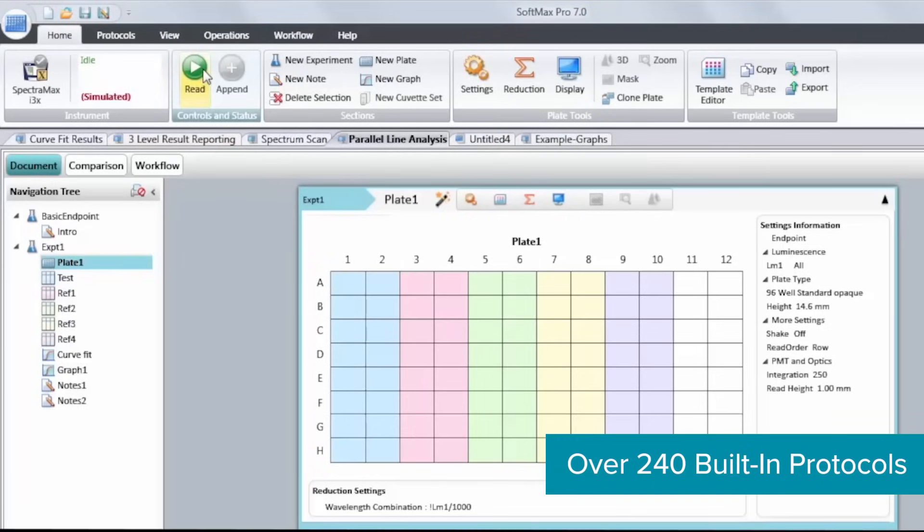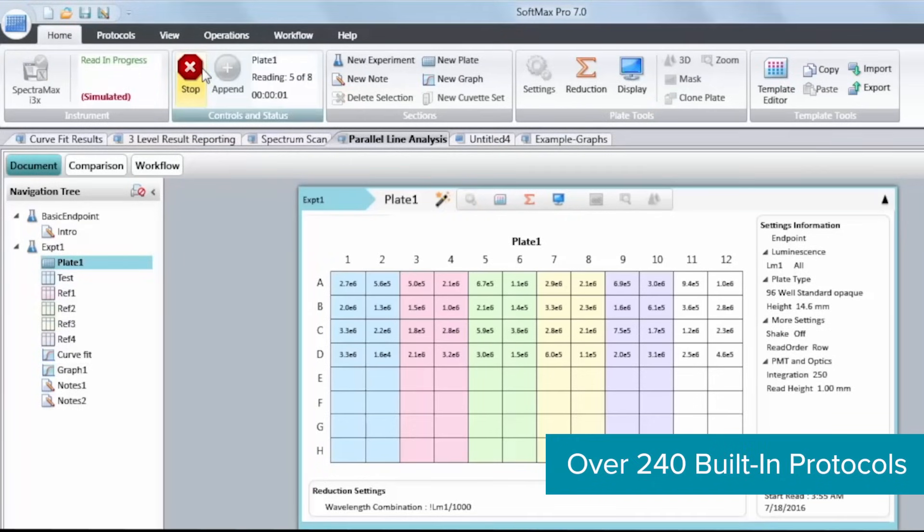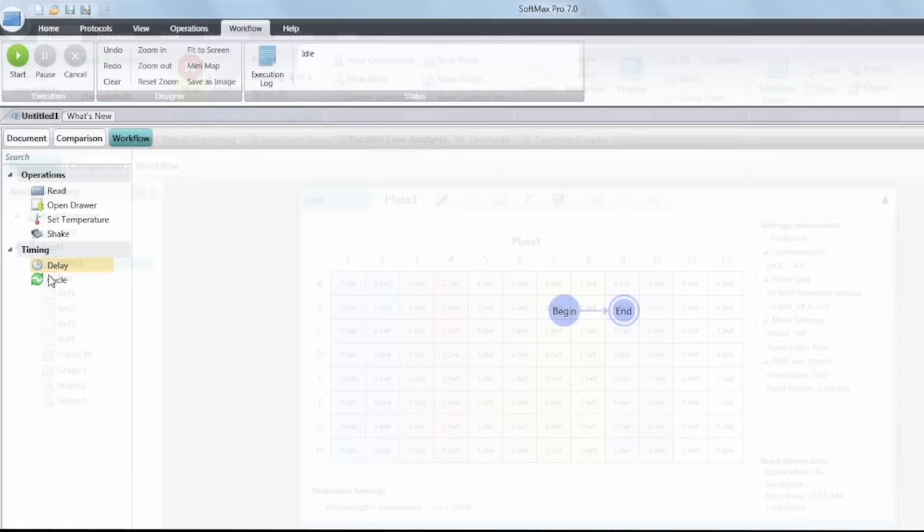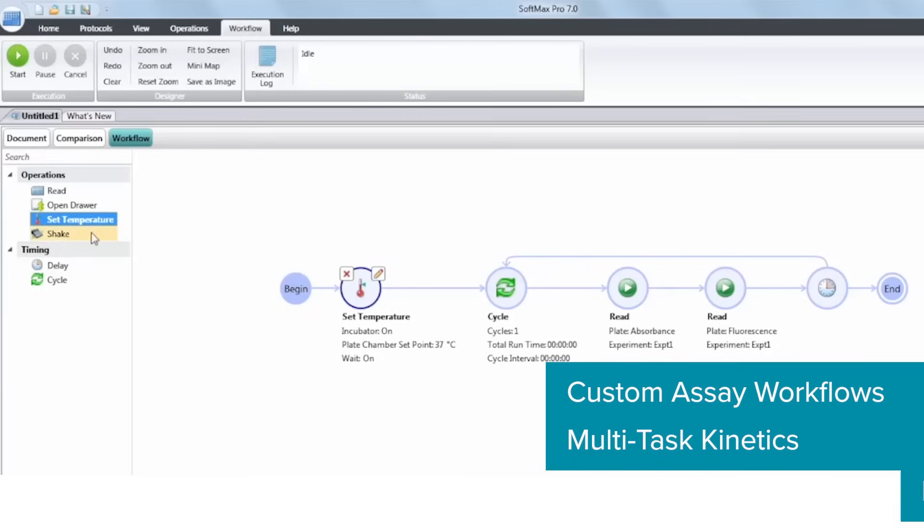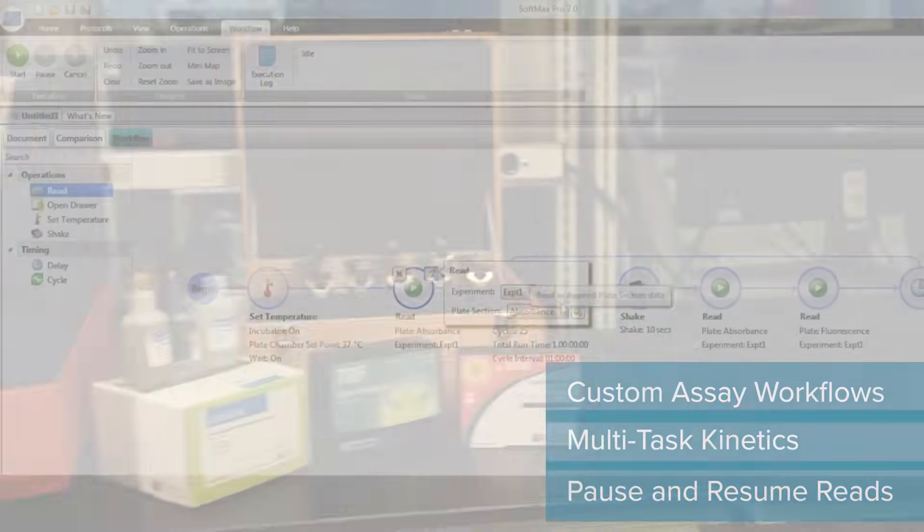Over 240 built-in protocols simplify data acquisition and analysis. Advanced reader control includes custom assay workflows, multitask kinetics, and pause and resume reads with discontinuous kinetics.